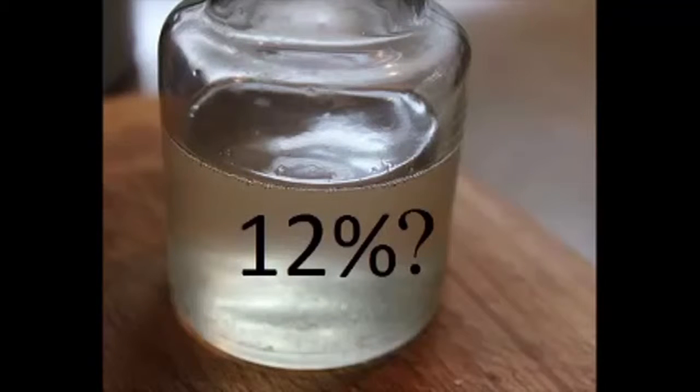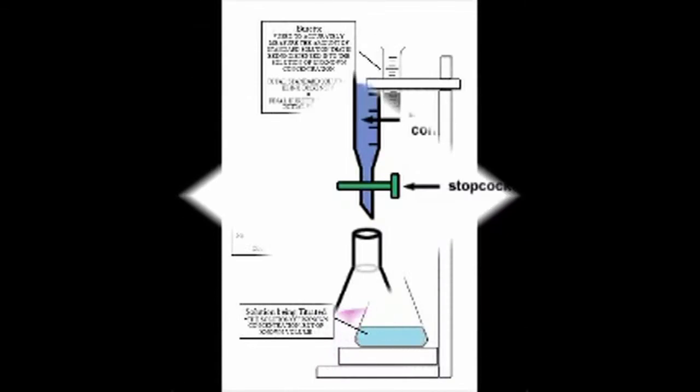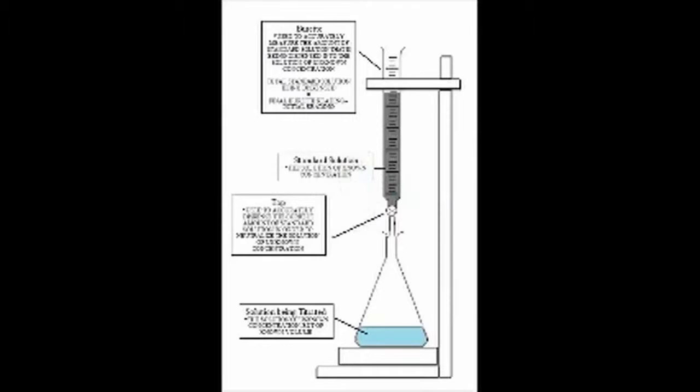Therefore, in this lab, we tested the concentration level of Gaytan's vinegar using the process of titration. Titration is the process of determining the concentration of a dissolved substance. This method will allow us to find the real concentration of the vinegar given to Gaytan Food Incorporation.